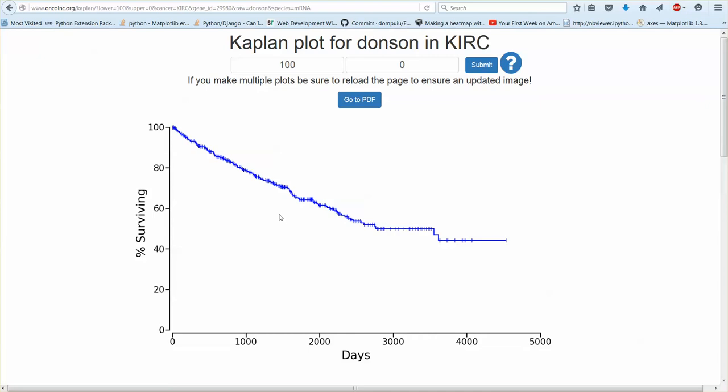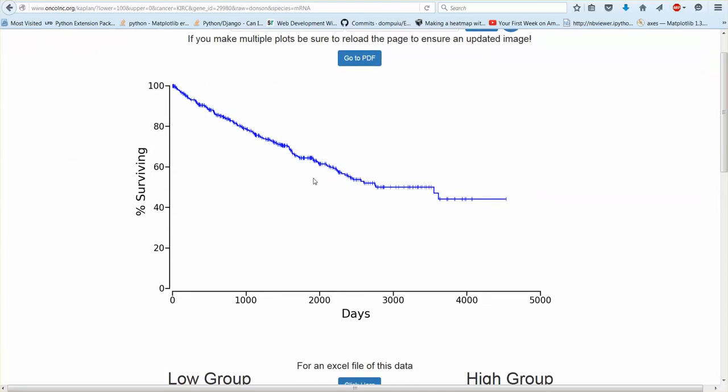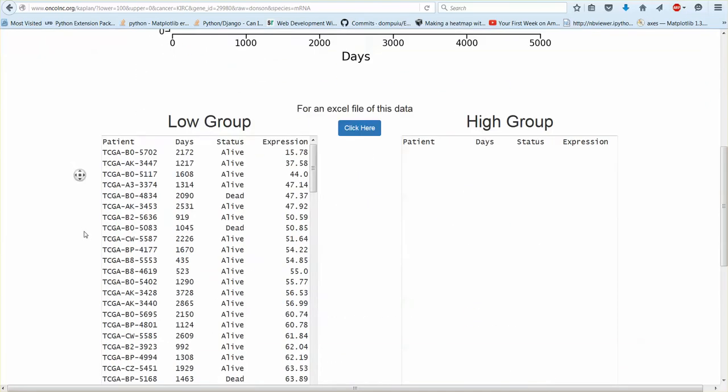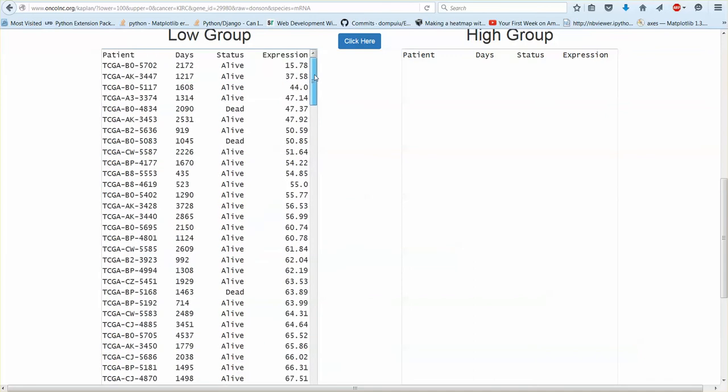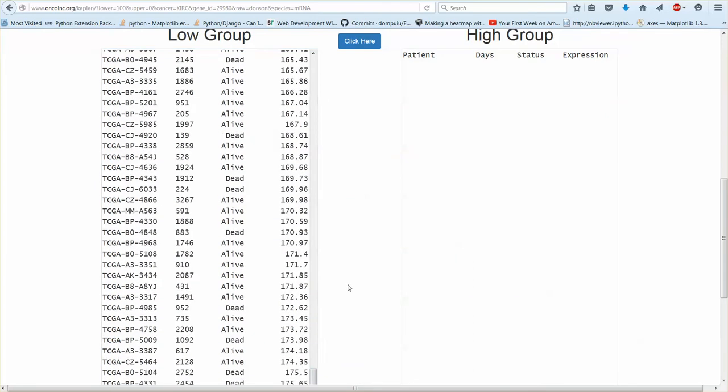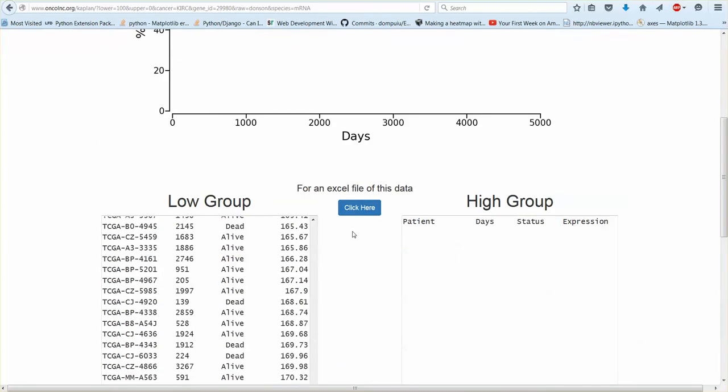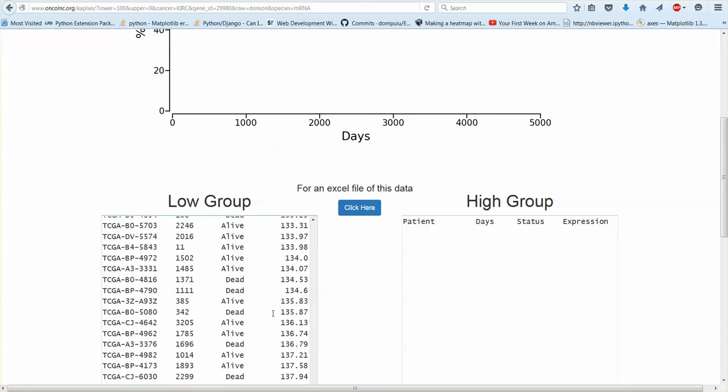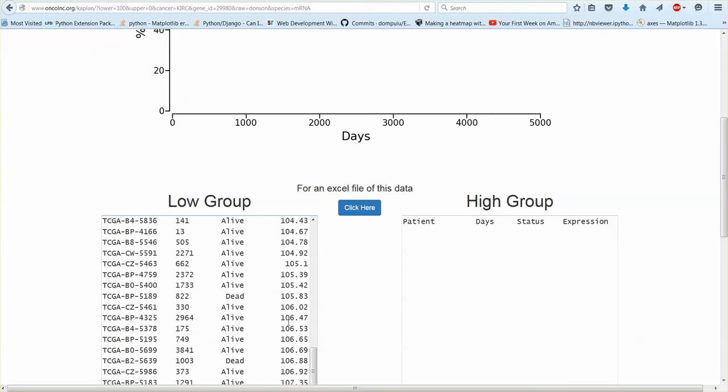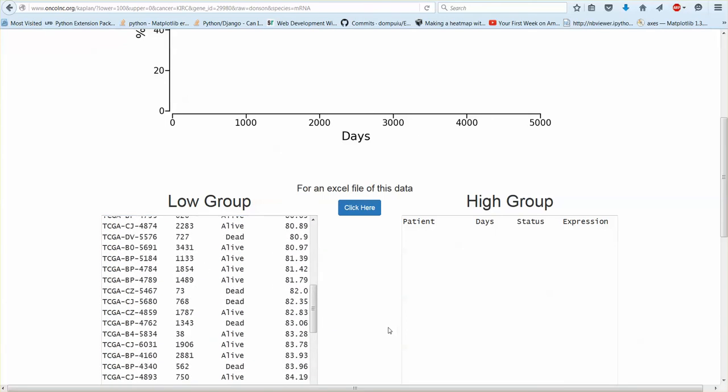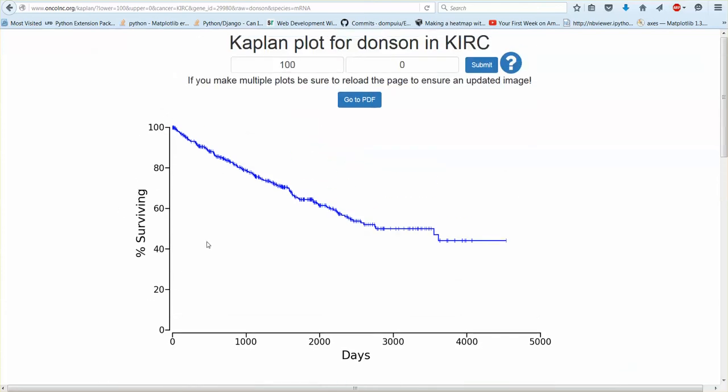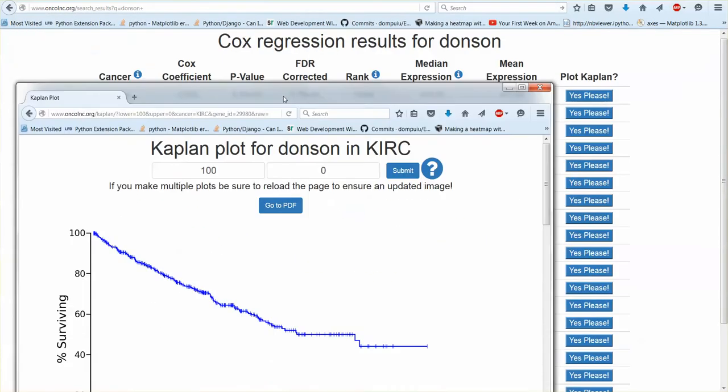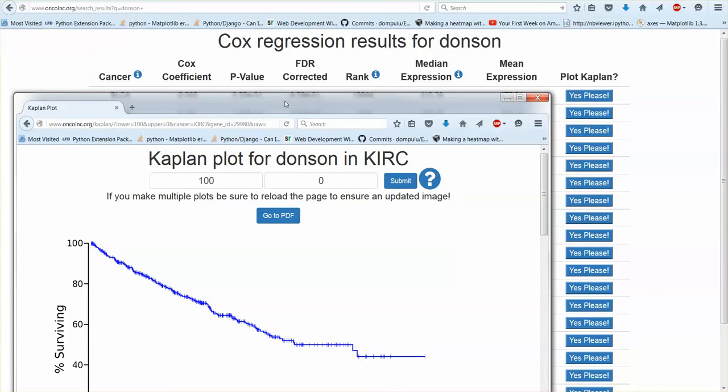So obviously if you only have one group you're not going to get a log rank p-value. There's only one group so there's nothing to compare. This is just all the data and then all the data will be in the low group and then you could download the entire data set and then you could use a different software to create your plot if you're unhappy with how these plots are. Okay, I'll go into some more detail now.